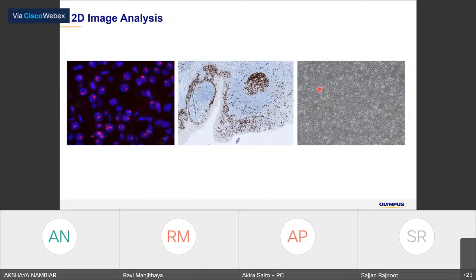So actually, there are lots of observation methods in microscopes. For example, fluorescence on the left hand, bright field by using some kind of stains and a color camera, and sometimes you use phase contrast or DIC to get the contrast.